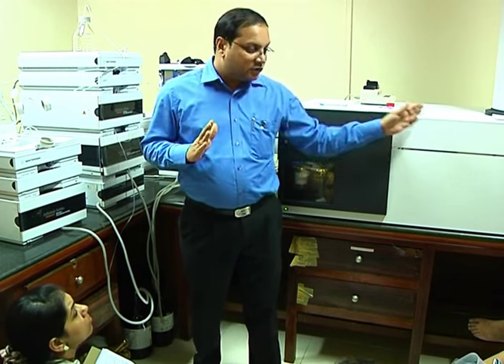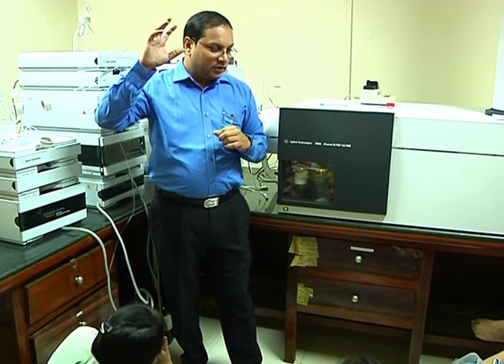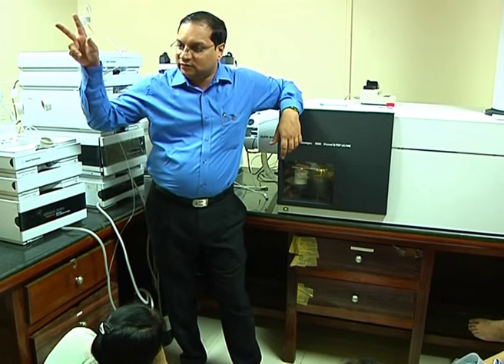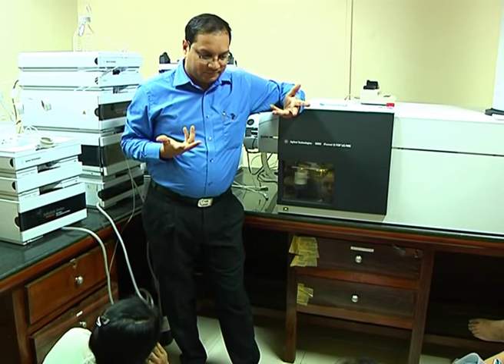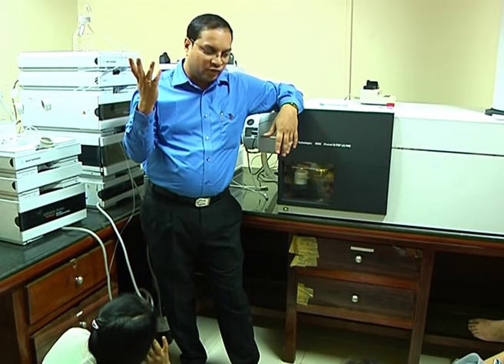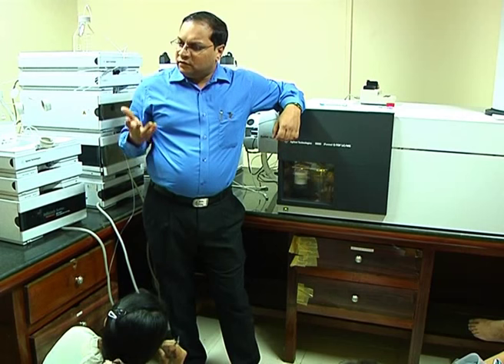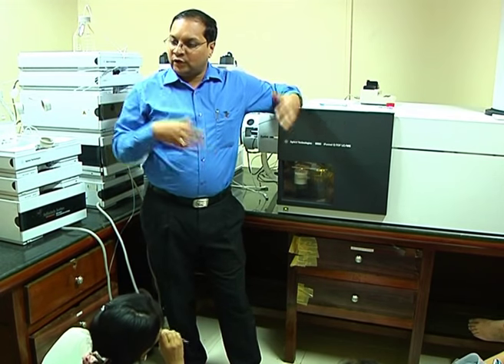Hence it is not accurate. So if I submit triple quad data to a database, there will be many peptides of the same mass but different sequence. It will pull out all the information because it doesn't have accuracy. It will see 500 and 501 only, and you will get redundant information. For the same mass, you will get hundreds of peptides. You started with nowhere, you end up nowhere.